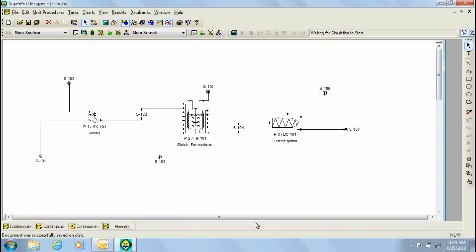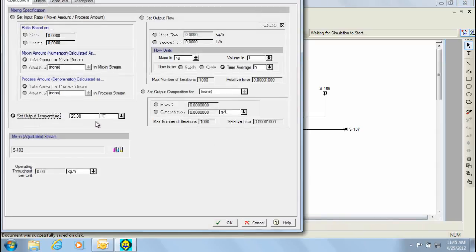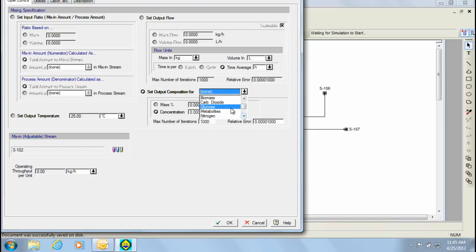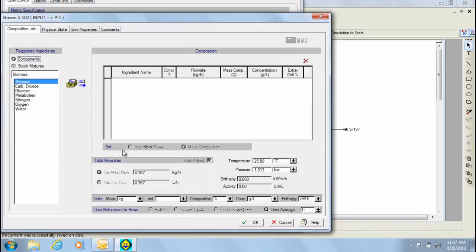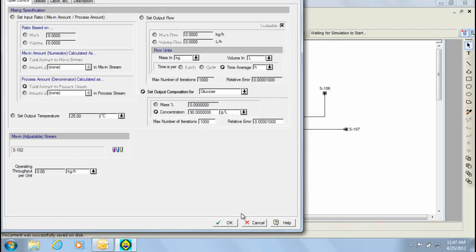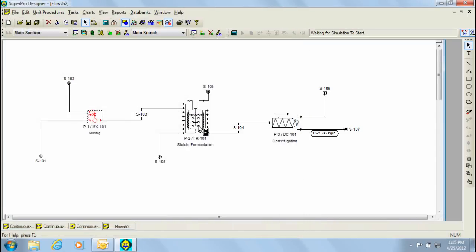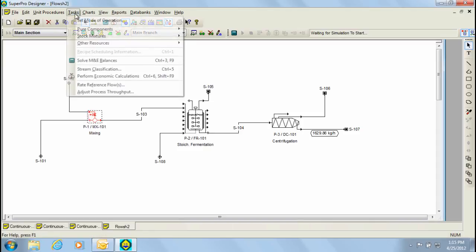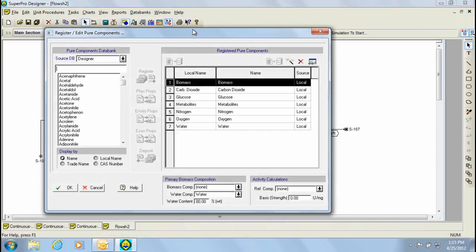Let's now proceed to initialize the procedures, starting with the mixing unit. Through this dialog, we need to specify the dilution of glucose, which we can do by setting the output composition for glucose to 90 g per liter. Besides the composition, we also need to allocate water in the adjustable stream. Notice that besides setting the output composition, mixing can be specified in several other ways. Before I continue to initialize the fermenter, I'm first going to revisit the pure components edit dialog to adjust the intracellular water content of the biomass. The intracellular water content of biomass can be adjusted in this area; for this example, we're going to keep it at 80%.